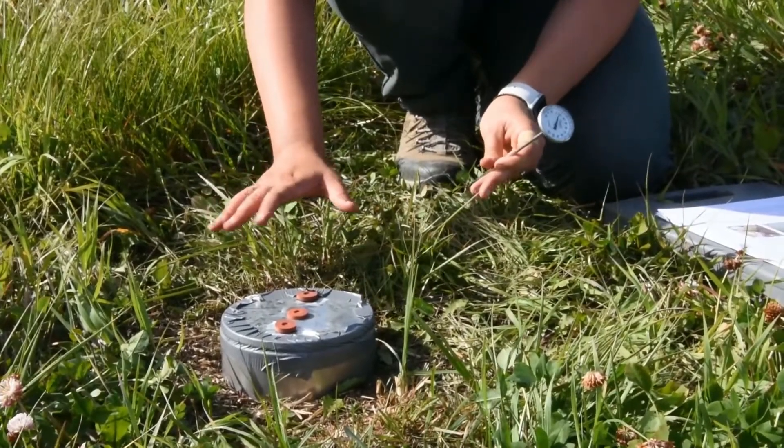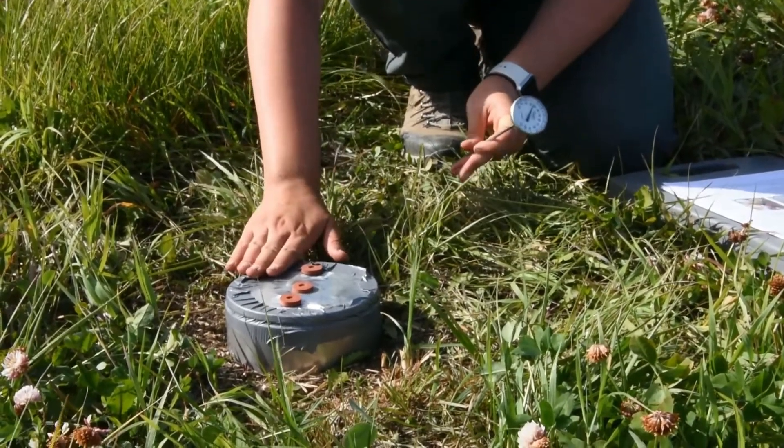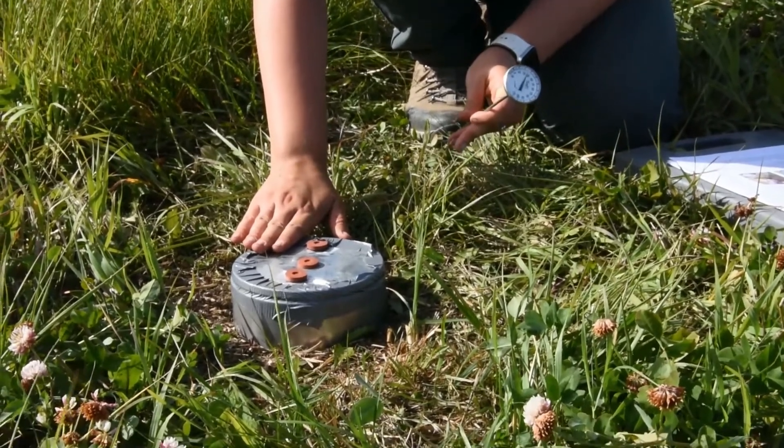We waited 30 minutes with the lid on and duct taped in, and it's time to take our measurement of soil respiration.